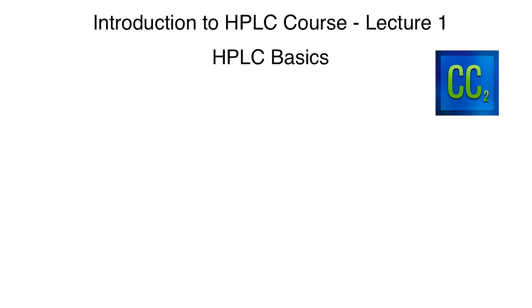Today we are going to be introducing an introductory course to HPLC chromatography. HPLC stands for High Performance Liquid Chromatography, and in this first lecture we're going to take an overview of HPLC and learn some of the basics, and then we will get into more detailed parts as the lecture series continues into different types of columns and how to manipulate mobile phases and things of that nature. So let's go ahead and get started with a general overview.